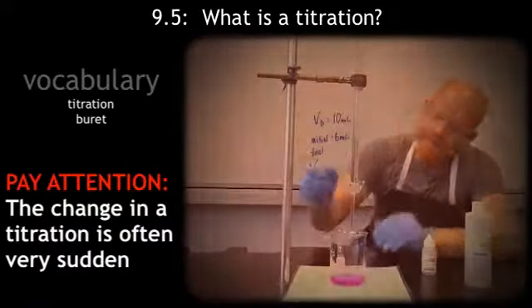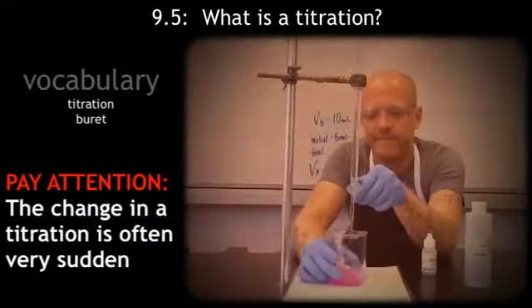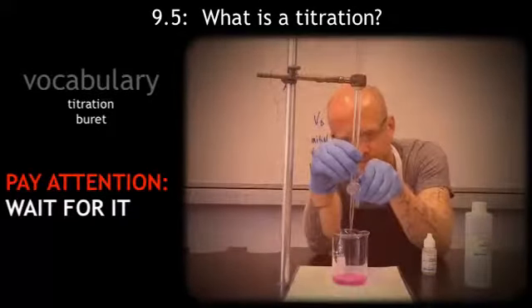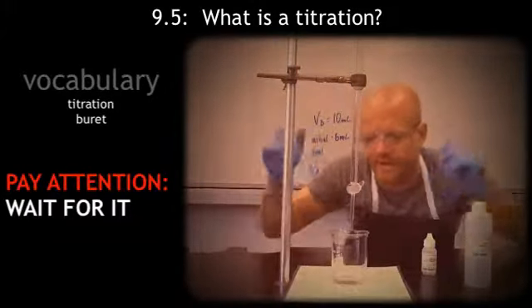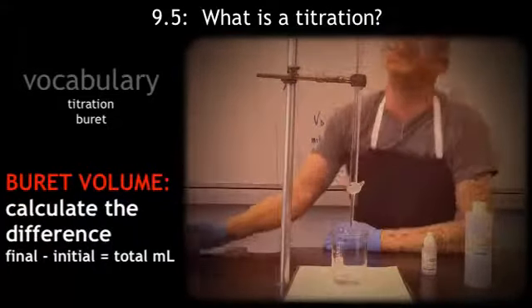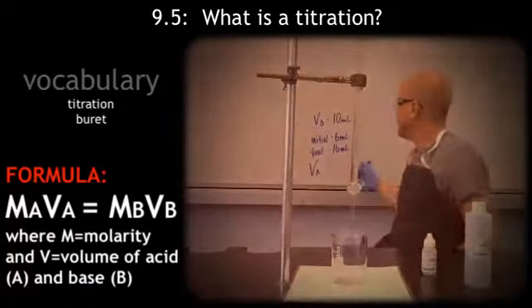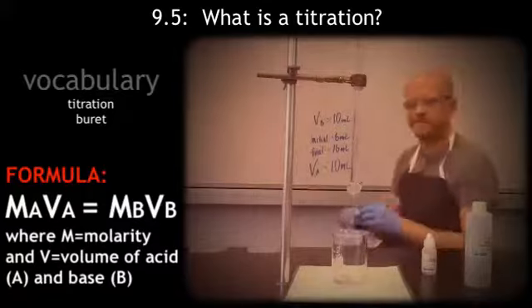And if you notice, it's still going, but I used a strong base, so this might take a little bit longer than I anticipated. Now as you add the acid, there will be areas that are colorless inside the solution, and there you go, it changed. So my initial volume was 6 milliliters. My final volume was 16 milliliters, which means the volume of my acid was 10 milliliters.